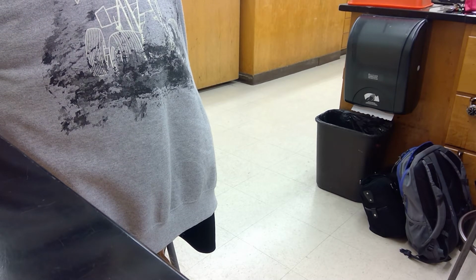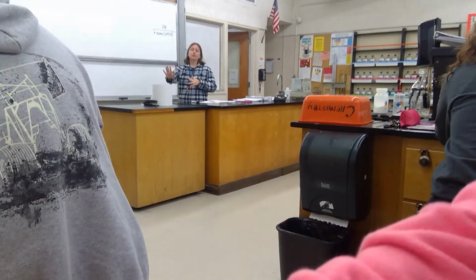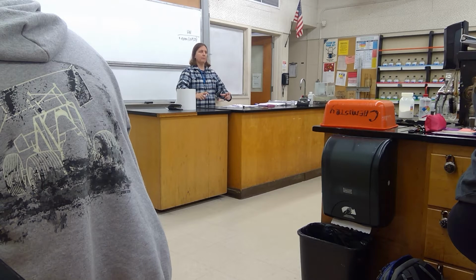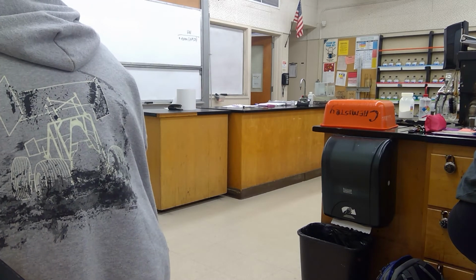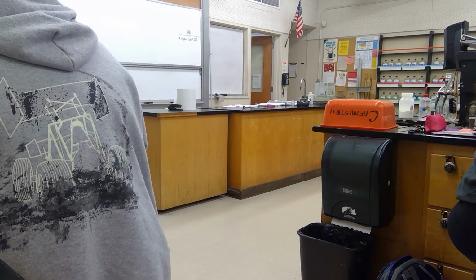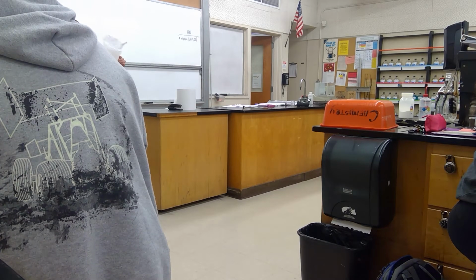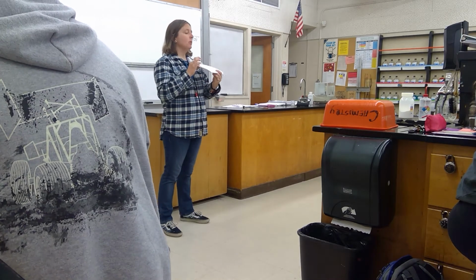Your hands have protein in them, your skin. And so I need you to wear gloves because otherwise you'll smudge the paper. So gloves first. Make sure you have a piece of paper towel so that you keep your paper on a paper towel. And so the chromatography paper is like, which one is it? Well, let's go with this one. So it'd be a rectangle.